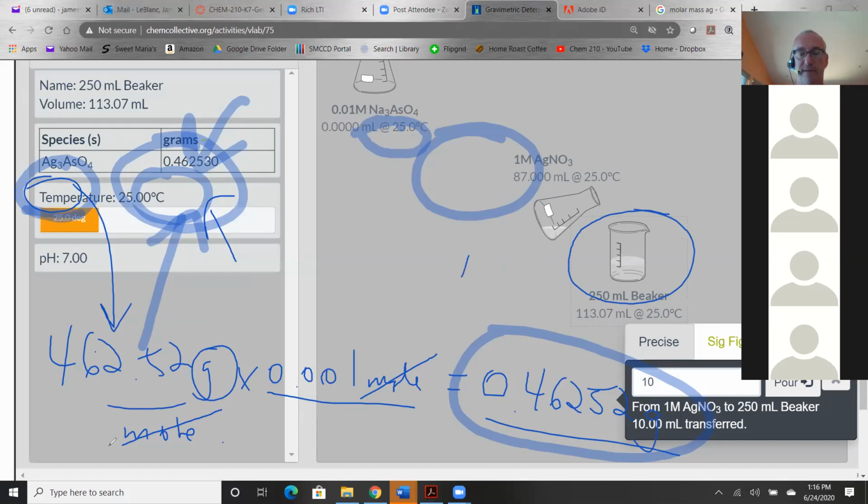So there's silver, it's just an ion floating around because there's nothing there for it to react with that will cause it to precipitate. All the stuff that would have made it precipitate is gone. So now it's just chilling, floating in solution. And the nitrate wasn't doing anything anyway. It never was. It's a spectator ion. So we could add the whole darn thing if we wanted to, and the mass is not going to increase.